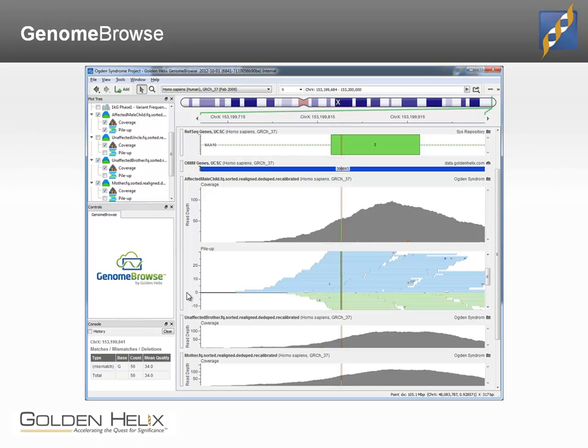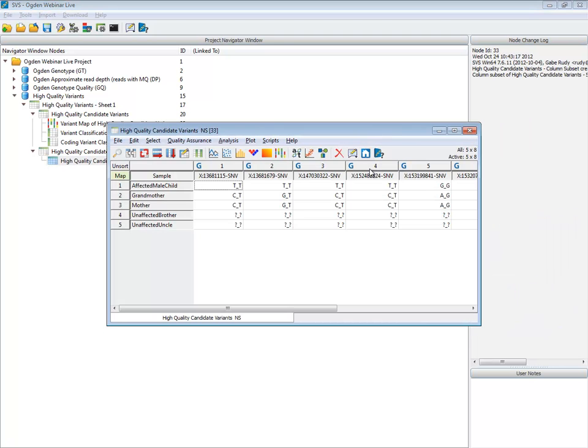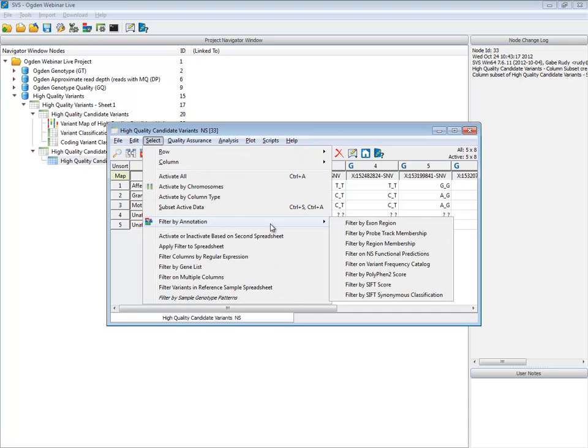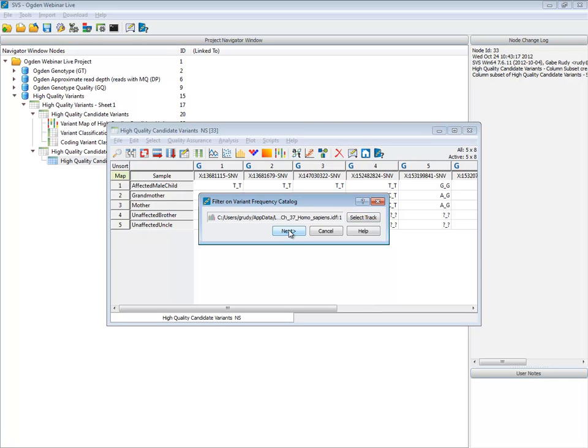So before we jump into anything else, let's go ahead and take our non-synonymous variants. Here's our 8, and do those 2 annotation steps. So I'm going to go to Select, Filter by Annotation, Variant Frequency Catalog, select that 6,500 exomes. There's a previous release in which the cohort was smaller, but we're going to use the latest release, 6,500 exomes.